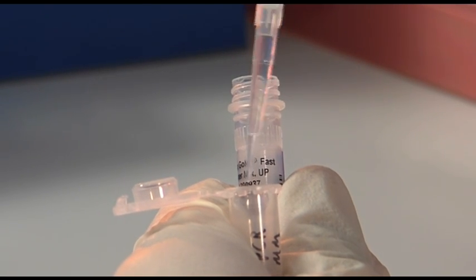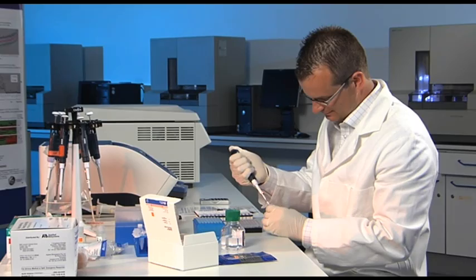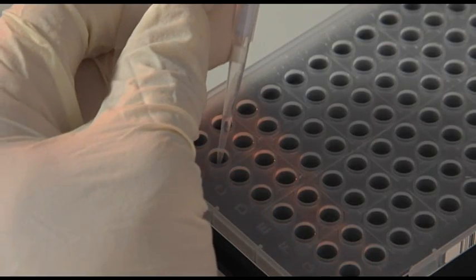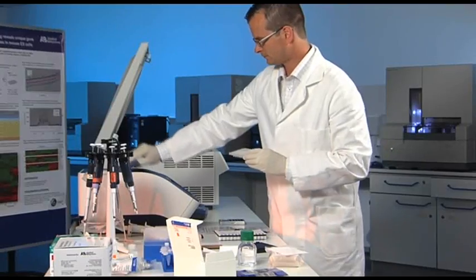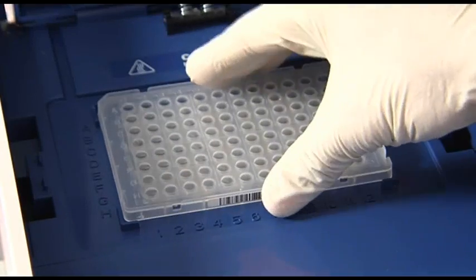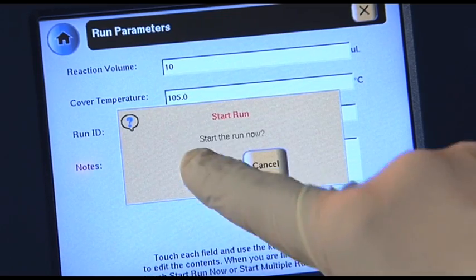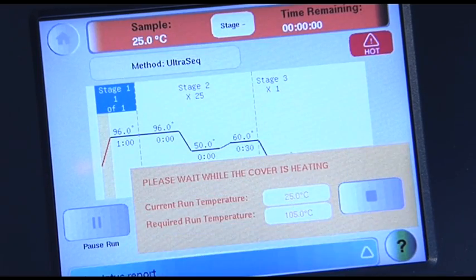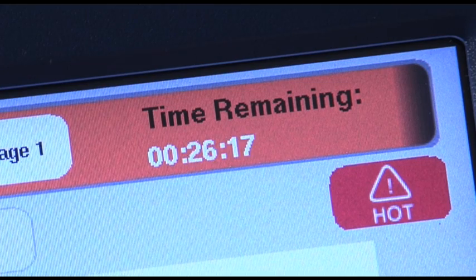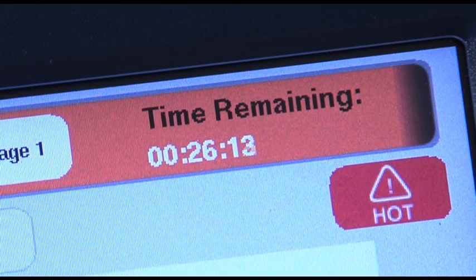This enzyme master mix was developed specifically for the rapid PCR amplification of DNA for subsequent cycle sequencing applications. Amplification takes place in only 40 minutes with the Verity Fast Thermal Cycler and dedicated Fast 96-well reaction plates.